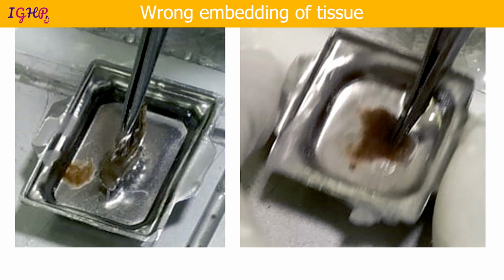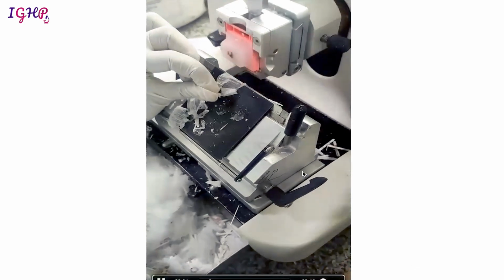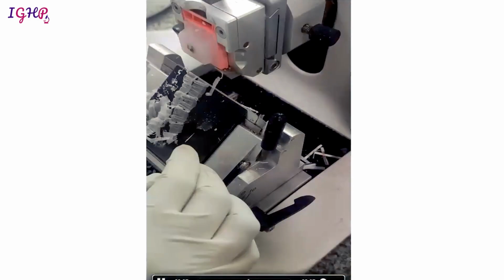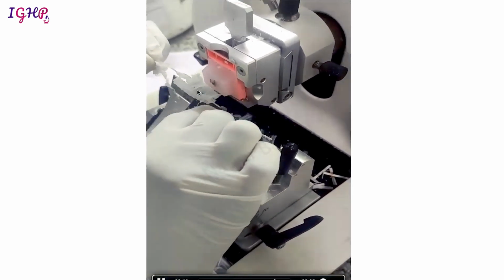And for larger tumors, you can give the maximum surface on the side of the mold where you want the cutting surface to be. Now, if your microtome blade is poor and they're repetitively using the same microtome blade, then this is what could happen. You take ribbons and the ribbons are cracking in between. So this is the problem that can arise if your microtome blade is blunt and you are not using a new blade, so you do not get a proper ribbon.